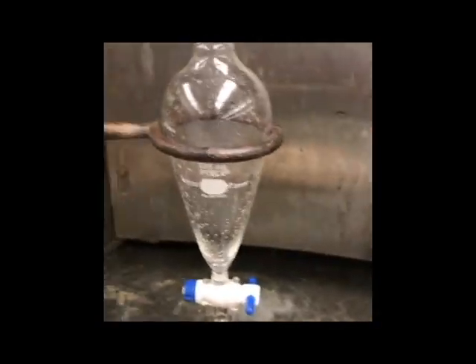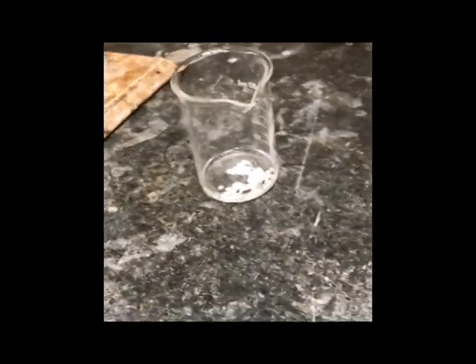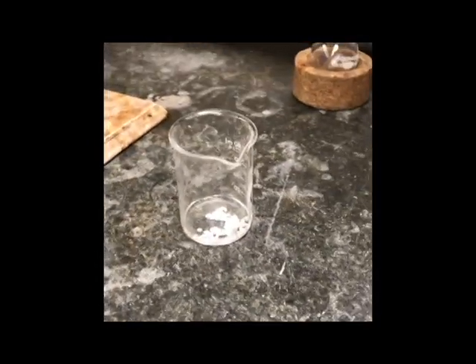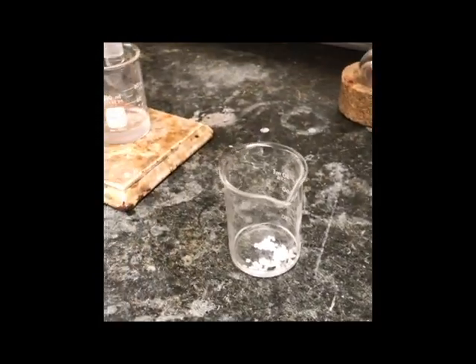So even though you remove the water from here when you did your separation, you're still going to have residual water left inside your cyclohexene. So the calcium chloride is supposed to absorb most of that water, acting as a drying agent. I know it says in the procedure to use a vial, but we just used a beaker. There's really no difference. You just need a little container to hold it in there. So we're going to let this dry for a few minutes, and then we're going to move to our second distillation setup.